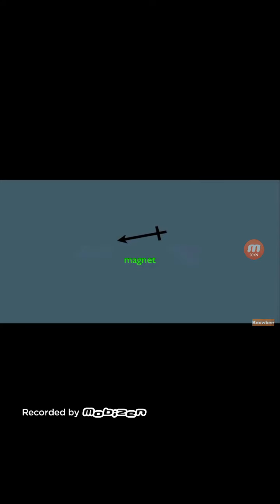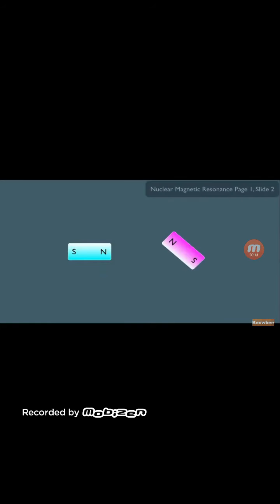Let's also remind ourselves of how magnets behave. Maybe you've played with them when you were a little kid, and you might remember that when you take one magnet, let's say this blue one, and stick it close to another magnet, it has an effect on that magnet. The north ends of these magnets would repel each other, and the north would be attracted to the south end of the magnet. So in response here, the pink magnet would move this way, like this. So what we're seeing here is that magnets can affect the orientation of other magnets.